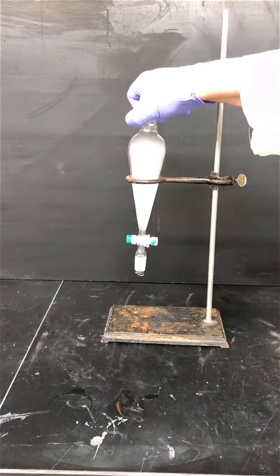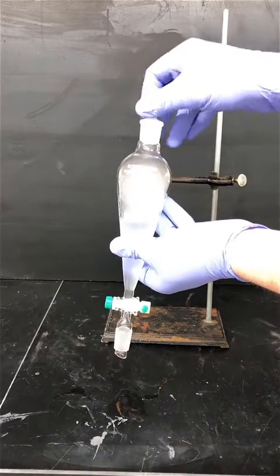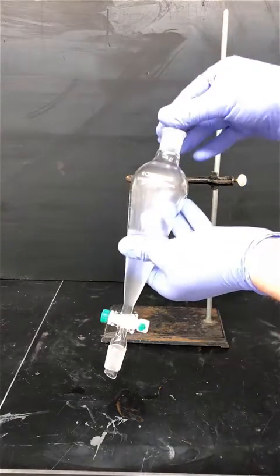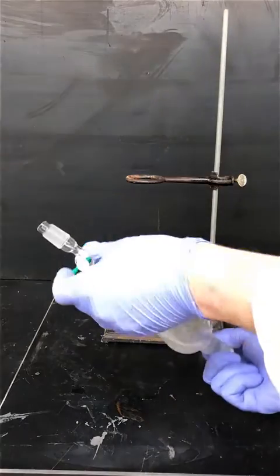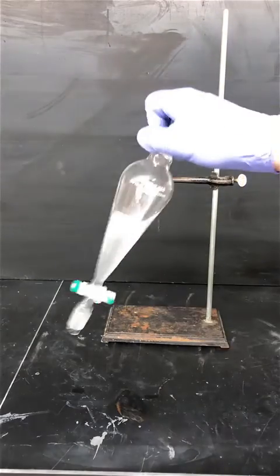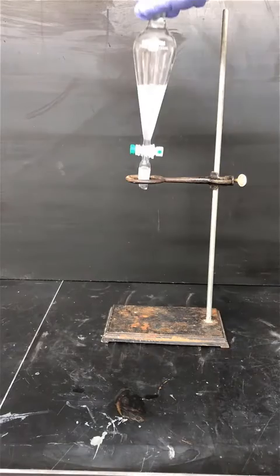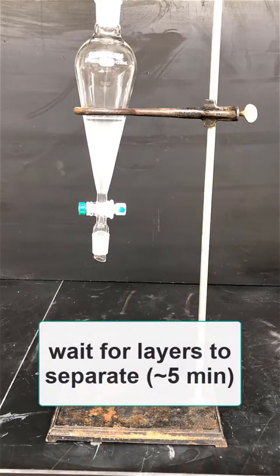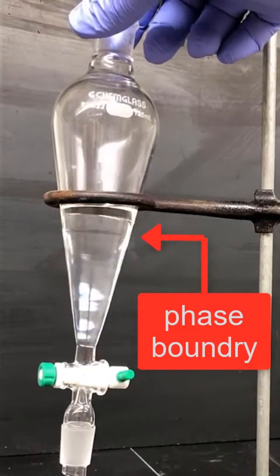Cap the separatory funnel and gently swirl it a little bit, periodically removing the top to vent pressure. Do this a few times before you invert, shake, and vent. Put the separatory funnel back in the ring and allow it to sit for a while for the phases to separate — this should take about five minutes. The phase boundary can be somewhat difficult to see, but if you look carefully you should be able to see it.